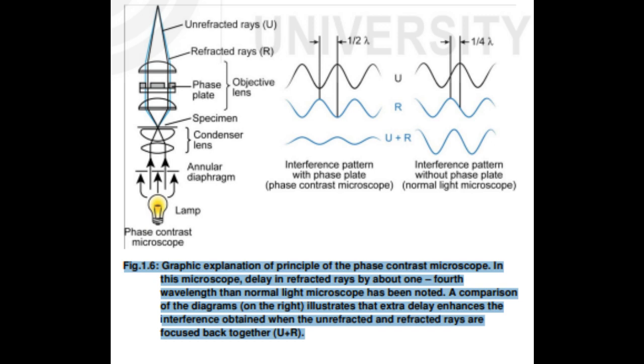The problem of staining and alterations in brightness can be overcome by this microscopy. The technique proves useful for observing colorless specimens. A transparent structure such as a nucleus transmits light when present in the mounting medium that surrounds it. The propagation of light through an object produces a change in the optical path. The shift in the phase of light passing through the structure and that passing around the structure forms the visible image.